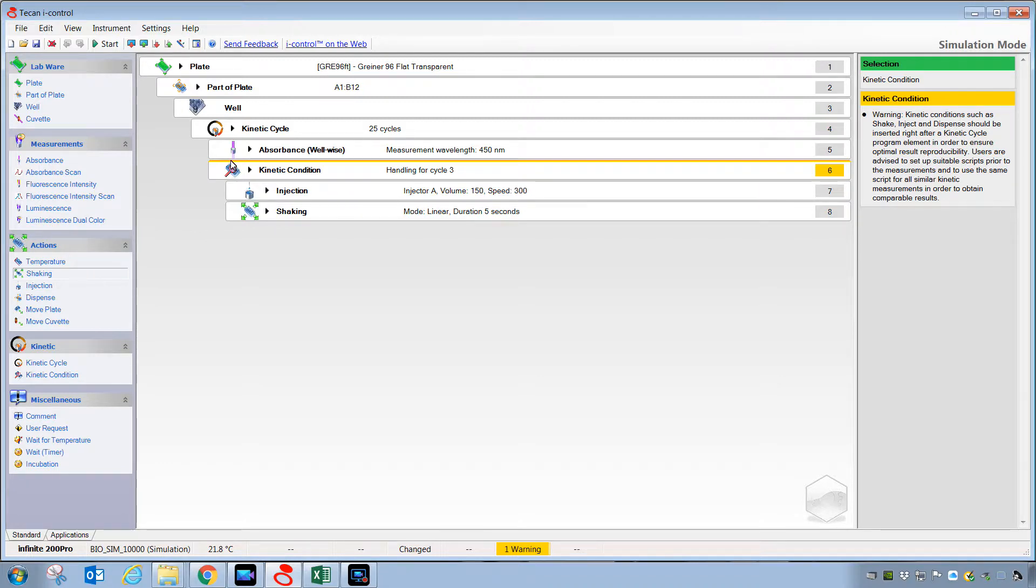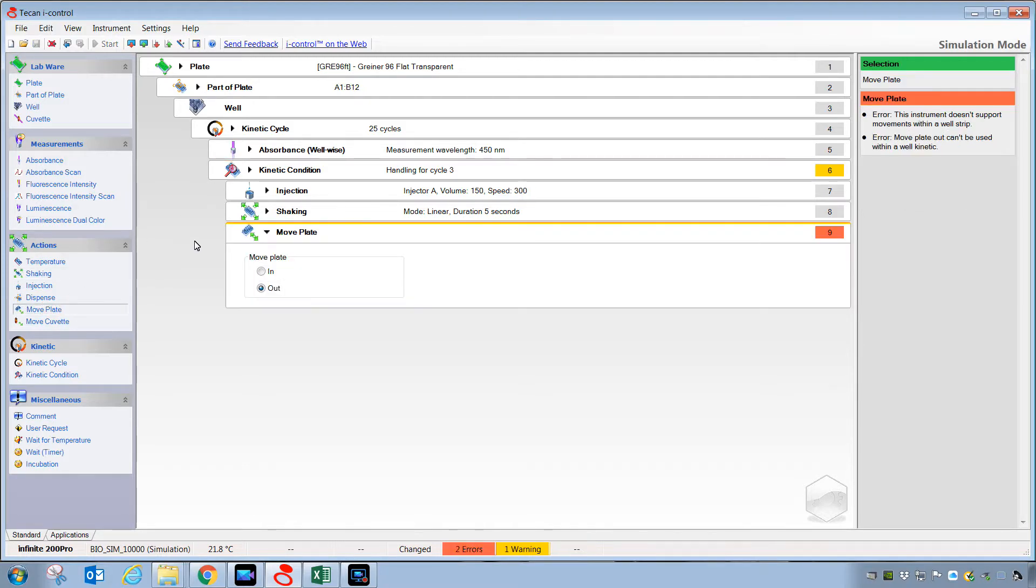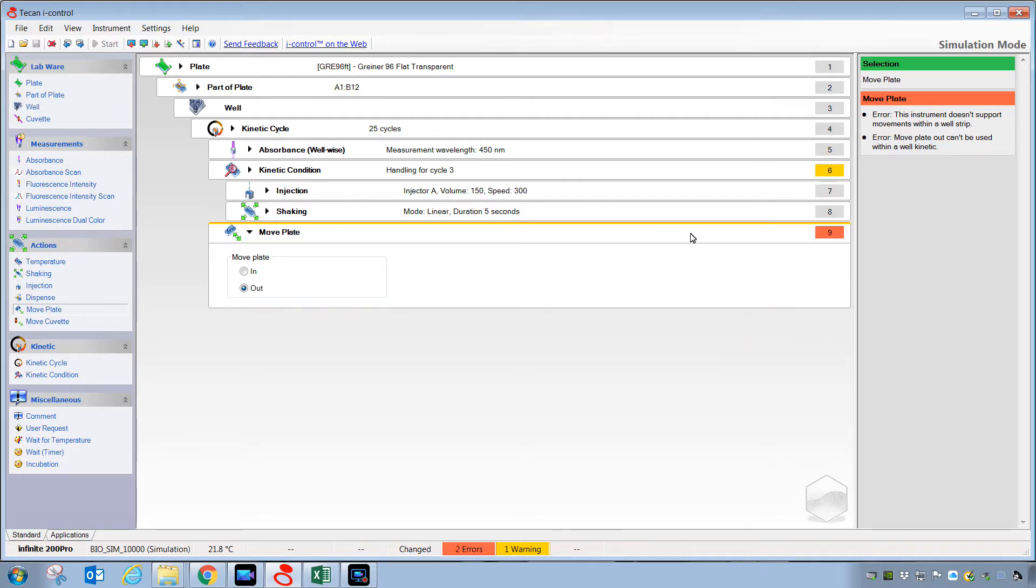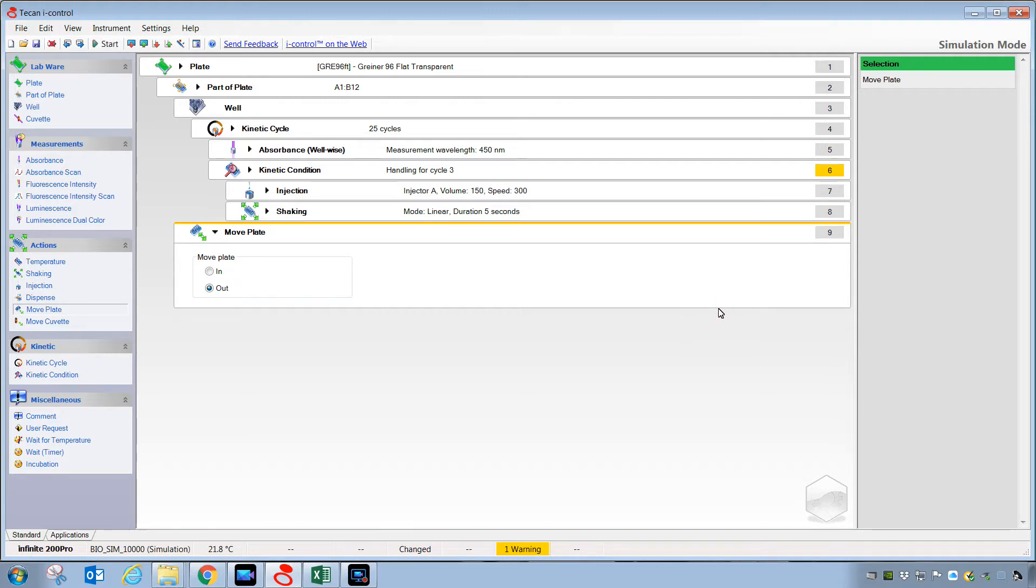Then, once those are completed, it will go back to just measuring this kinetic absorbance measurement until the end. If you'd like the plate to come out when it's completely finished, you can place this step here, but as the software is warning us, it doesn't like that this was within a well strip, so we want to right-click on this, and release it, and keep releasing it until it's completely unnested from the well-wise processing.